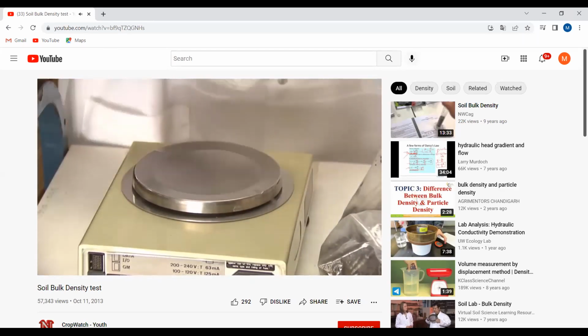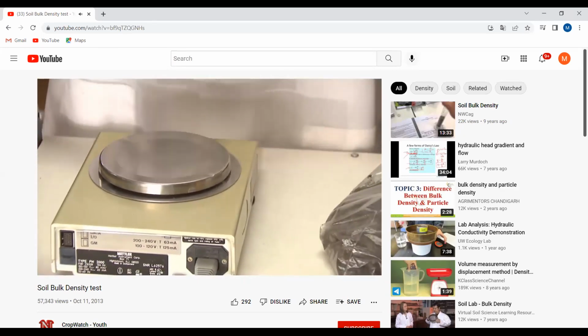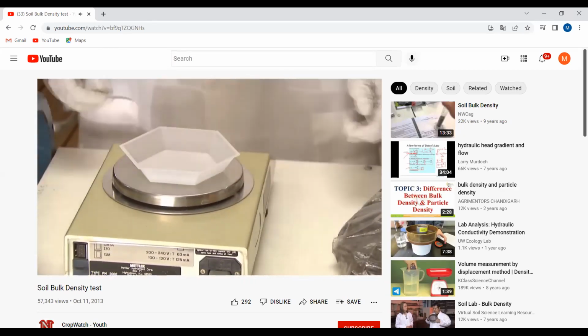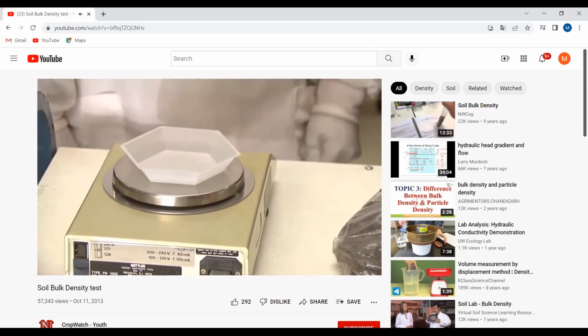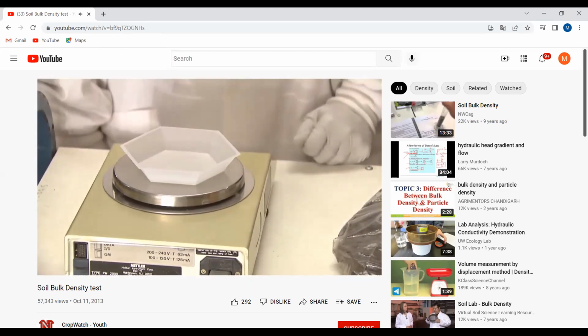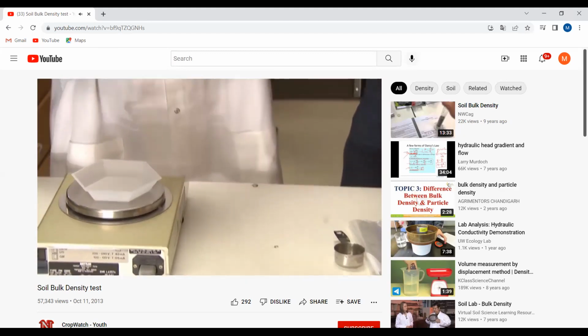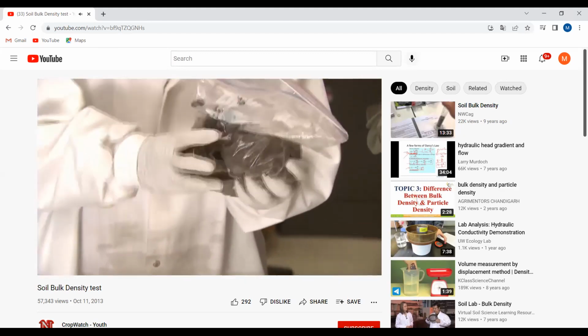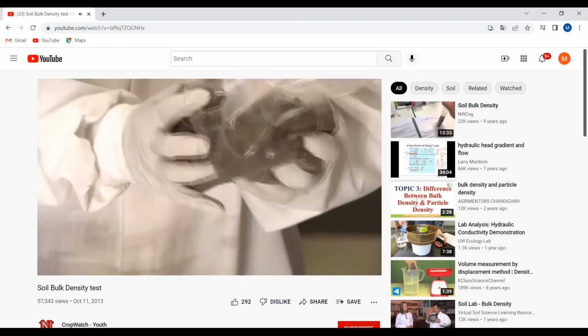Next step is to weigh an empty microwavable container. In this case, we're using a tray. If you have a cup, something that's microwave safe, that works too. Record its weight in table 2. And then the next step is to take our sample bag. We're going to mix the sample thoroughly by kneading it with your fingers. Virginia's done this quite a bit.